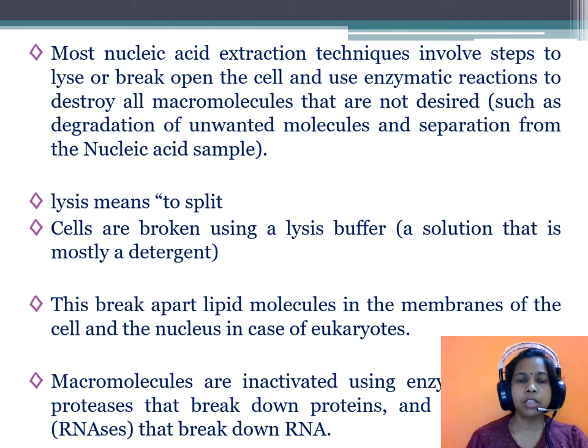Here, lysis means to split or break open the cell, and for lysis of the cell we can use lysis buffer. So, cells are broken using a lysis buffer. Lysis buffer is actually a solution that is made up of detergent. This detergent breaks apart lipid molecules in the membranes of the cell and the nucleus in case of eukaryotes. Since we know that lipid is one of the important macromolecules present in the membrane, it is broken apart by the lysis buffer.